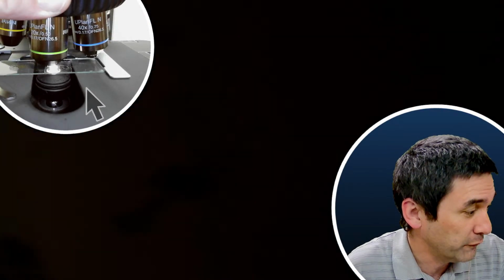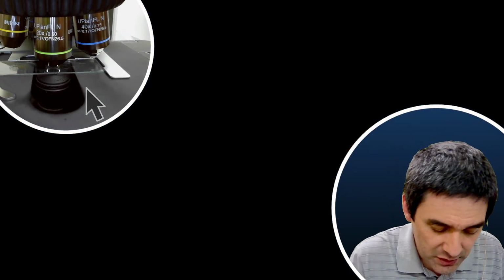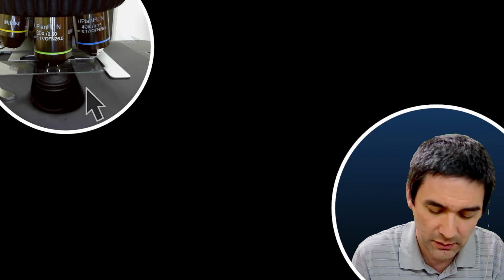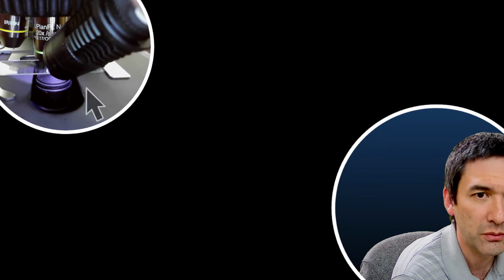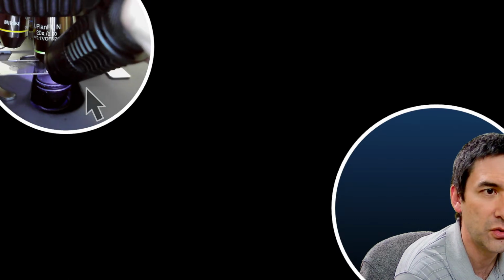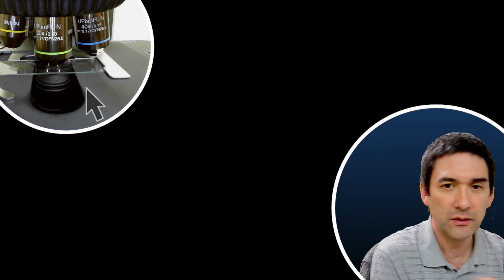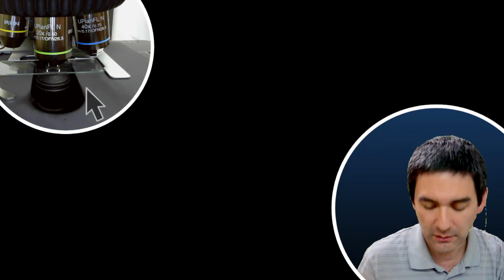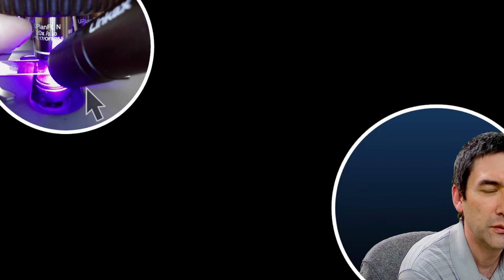So I'm going to do the following. I'm going to simply turn off everything here, and I've got some UV flashlights here. I don't know if this actually works. No, I don't see anything. So there is no autofluorescence, or it's so weak that I'm not able to see anything. There's another one here with a different frequency. It's a little bit more blue. Nah, not very much.